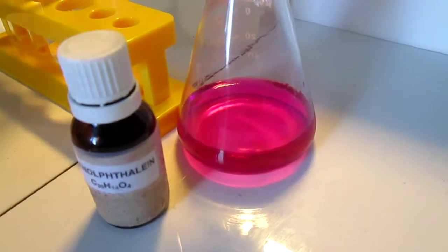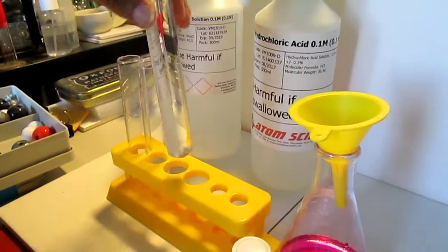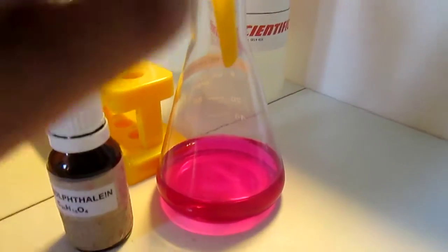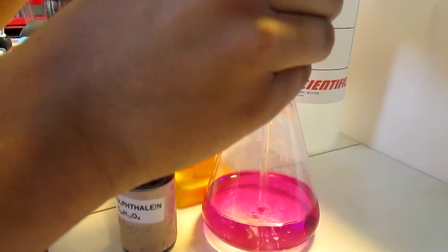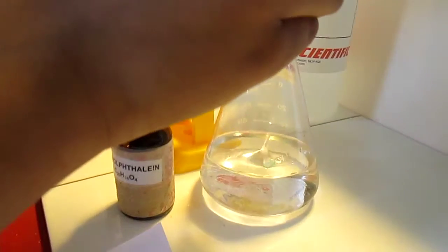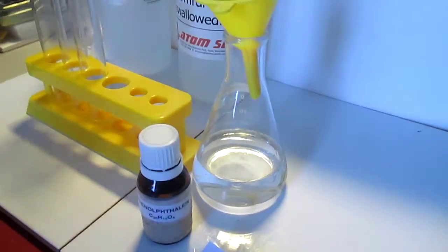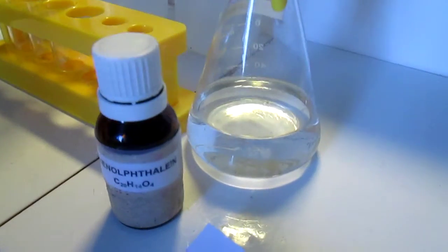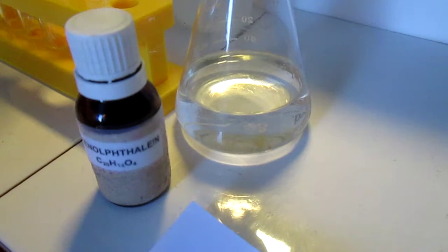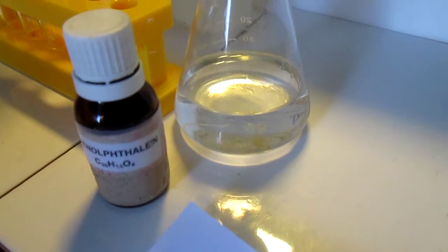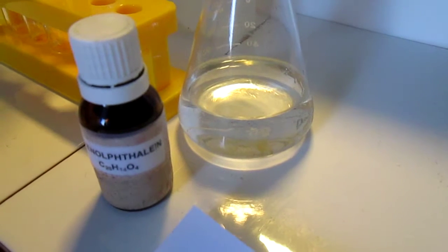Then we add hydrochloric acid into the flask. You can see the pink solution now becomes colorless again. This is because the solution is no longer alkaline due to the addition of the acid.